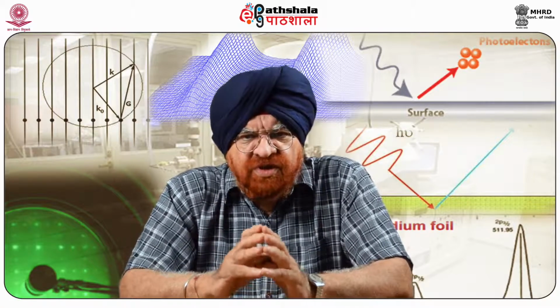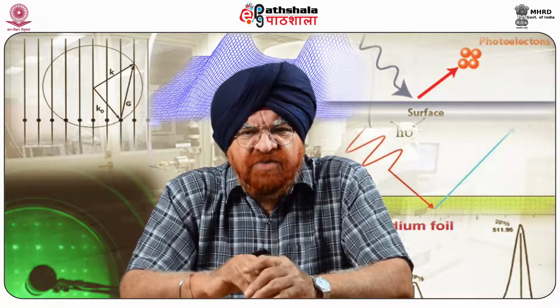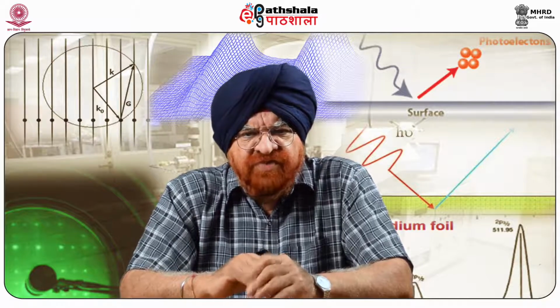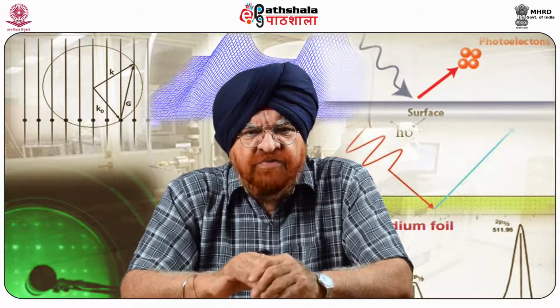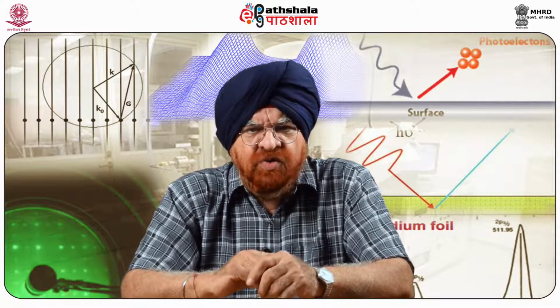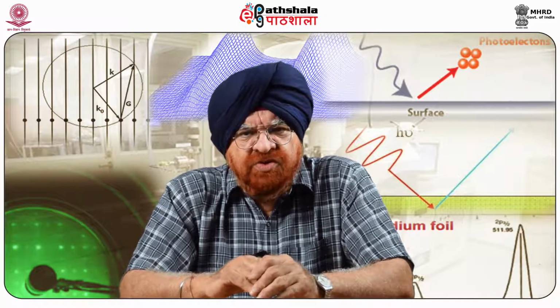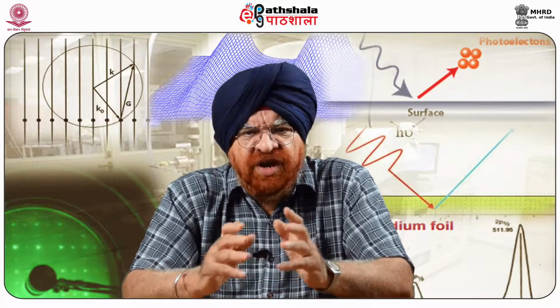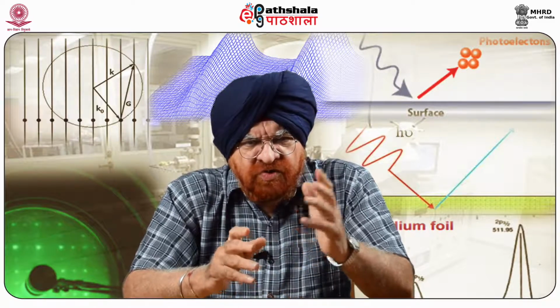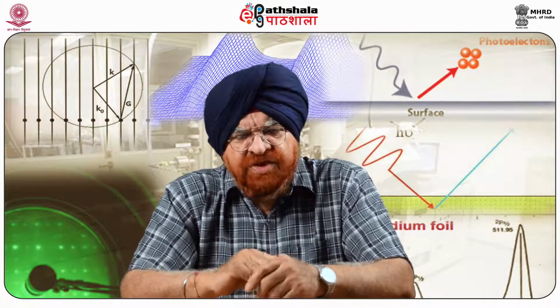Applications of these new microscopes to technology are demonstrated with images of an optical disc stamper, a diffraction grating, a thin film magnetic recording head, and of course a diamond cutting tool. The STM has even been used to improve the quality of diffraction gratings and magnetic recording heads. One can know how sharp or how properly they are working with the help of STMs.